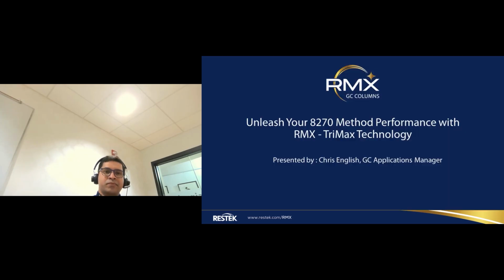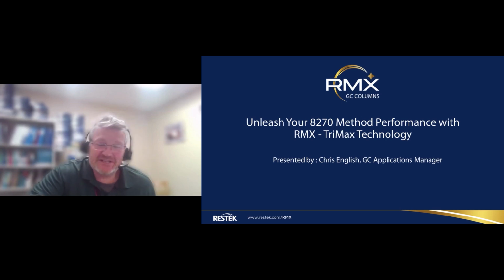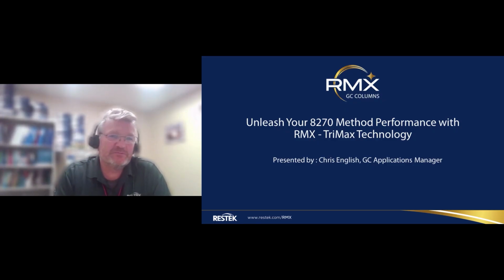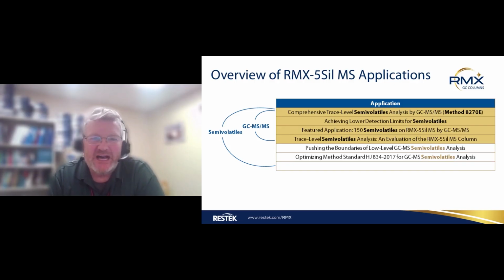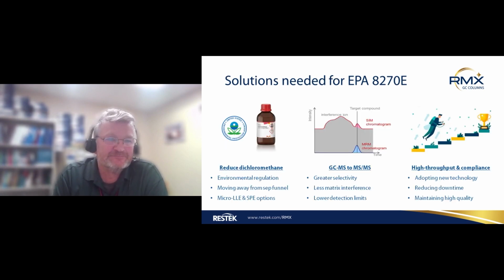All right. Thanks, Ram. So in this particular part of our presentation, we're going to talk about 8270 method performance, semi-volatiles, low-level performance. We're going to evaluate single MS versus MSMS and do a comparison. So here are the different applications that we'll take a look at. There are the GCMSMS applications, and then there are two MS applications at the bottom that we'll discuss. All of these will highlight the advantages of using this column over a standard column format.